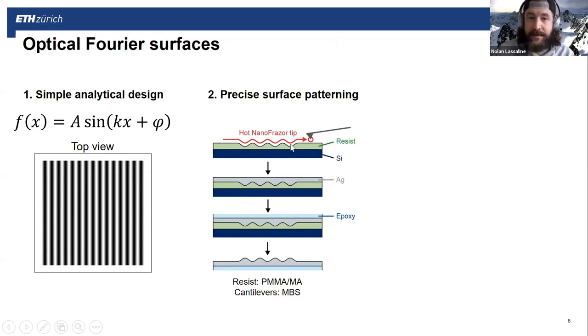And so, we pattern the surface with this 3D profile that we care about, and the way that we go about transferring it to optical materials, in this case silver, which is what I'll be talking about today primarily, is we use a thermal evaporator. So we evaporate the silver such that it fills up the profile. Then we take glue, we stick it on the back of the silver, and we simply pull it out of this so-called template. This is called template stripping. This is a common process in a lot of optical devices.